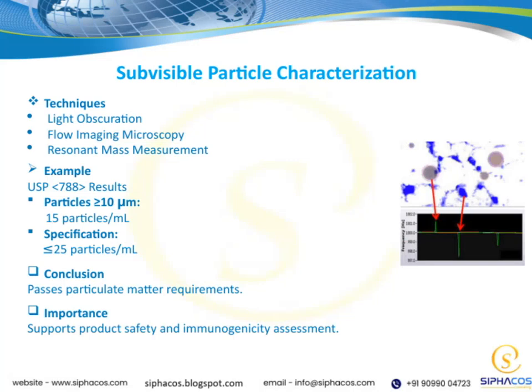Let's talk about how we characterize subvisible particles, those tiny bits we can't see with the naked eye but matter a lot. We use several techniques: light obscuration, flow imaging microscopy, and resonant mass measurement. Here's an example from USP Chapter 788, where particles 10 microns and larger were measured at 15 particles per milliliter. The specification allows up to 25, so this product passes with room to spare. This testing is crucial because it helps ensure product safety and reduces the risk of immune reactions.